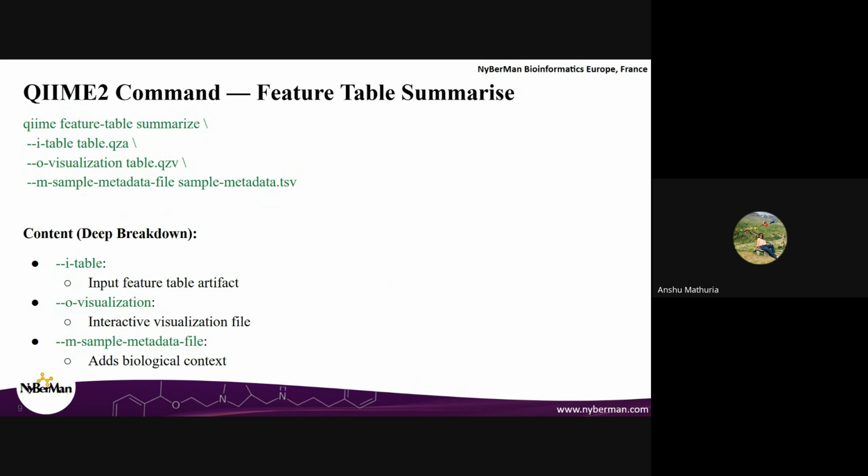So that is why I told that there is a transition now from the raw reads and analyzing, removing any error and all of that, from correcting the sequences to putting a biological meaning behind those sequences. That's why we are using a sample metadata file in these commands.